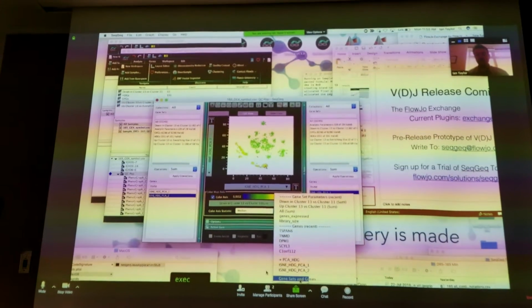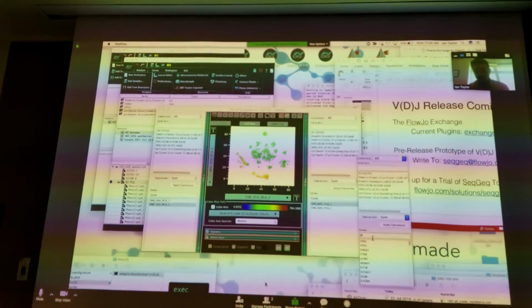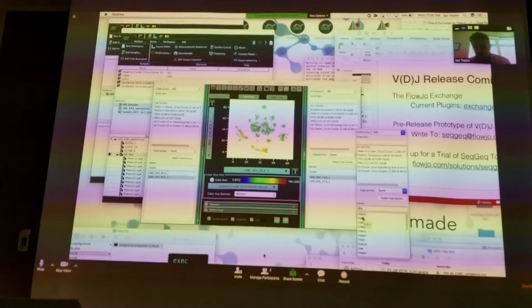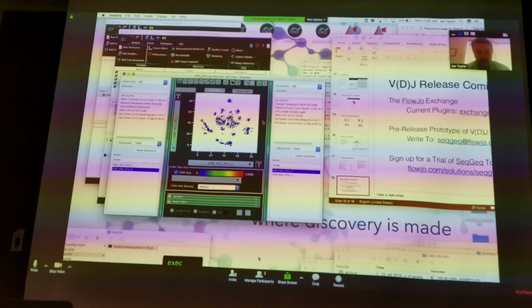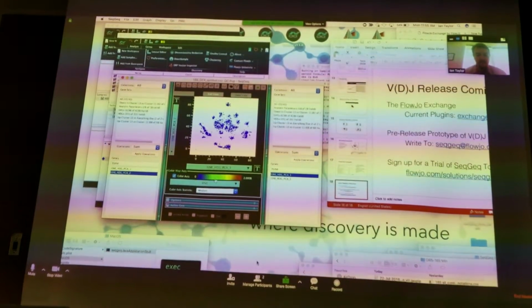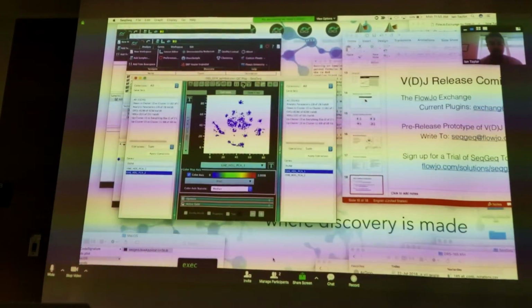So if we were interested in a particular feature within this data set, you could search for it like this. I don't see a lot of interferon activity. It looks like maybe one here, but I would note that this color scale is highly sensitive to the scaling of the parameter, the tertiary parameter that we're looking at.